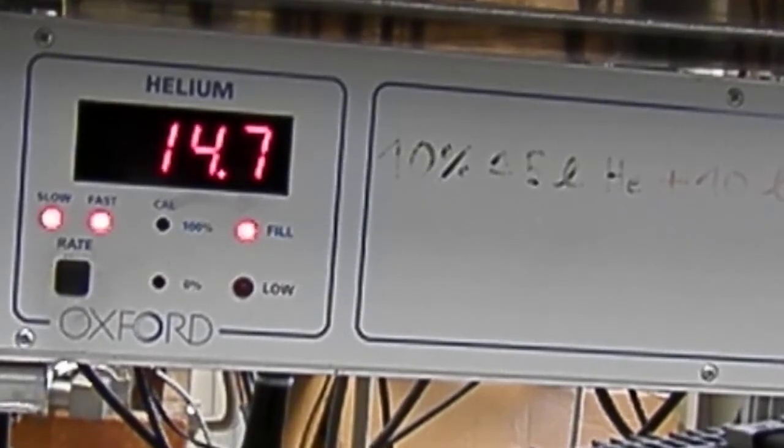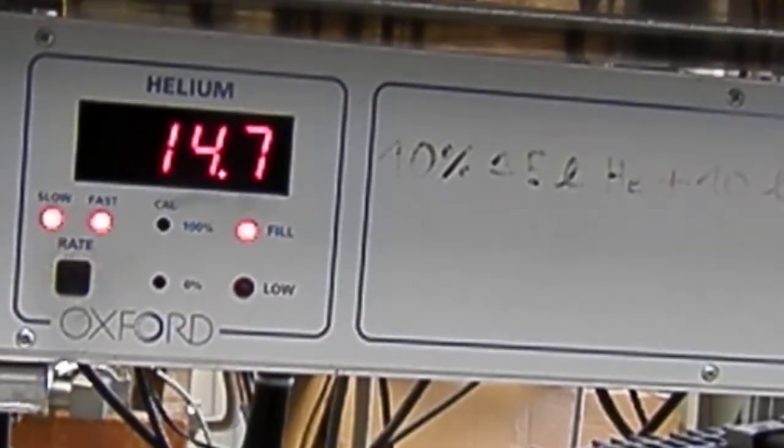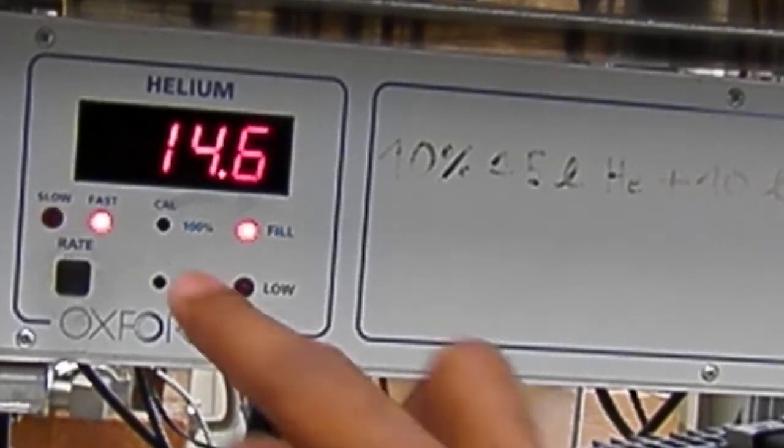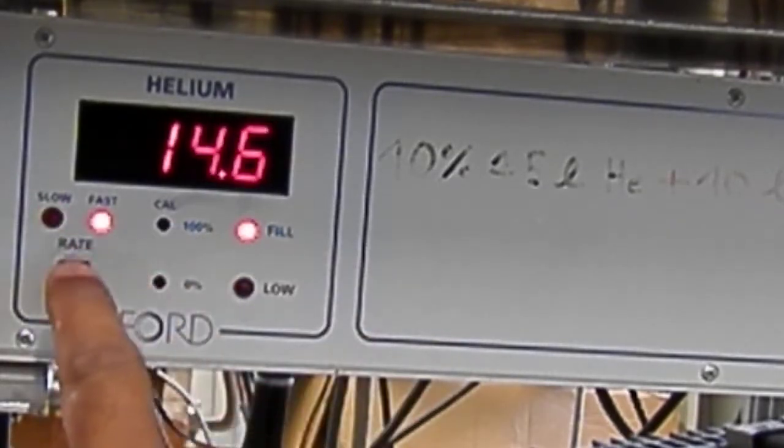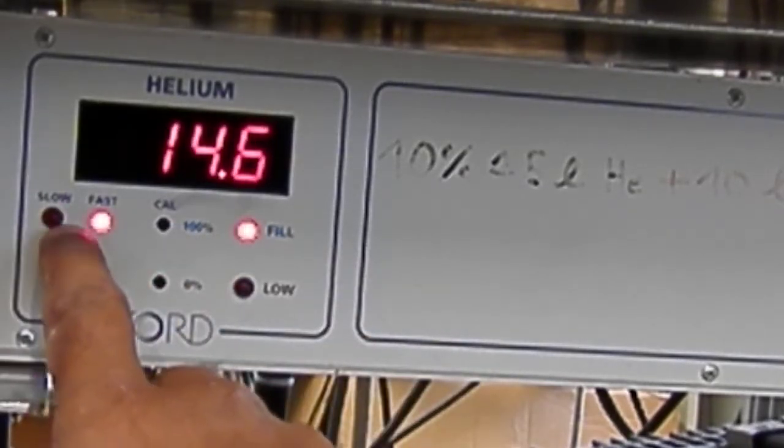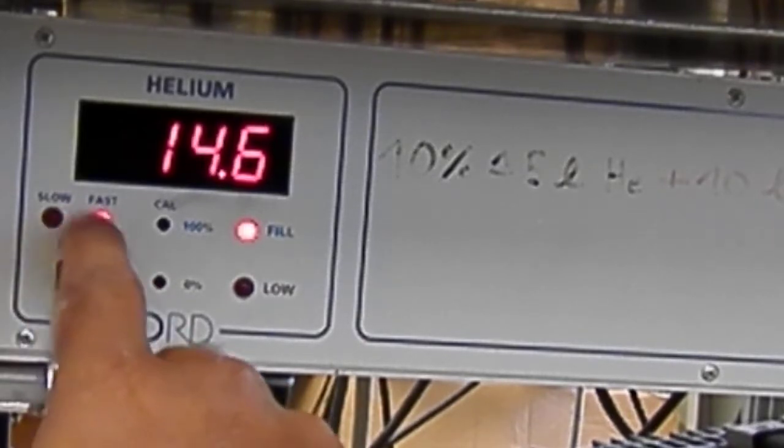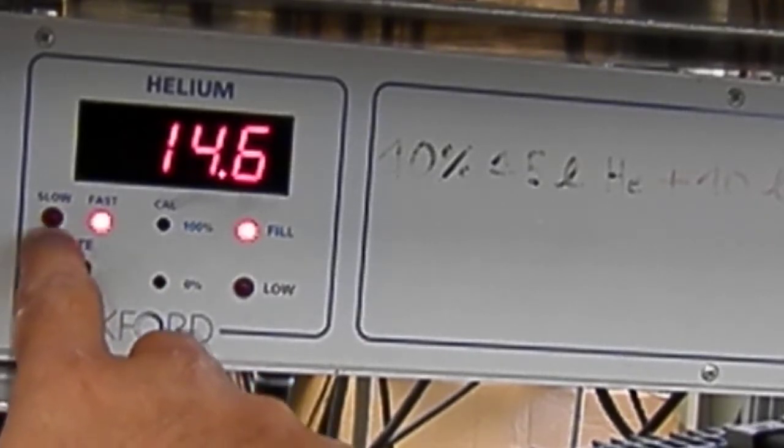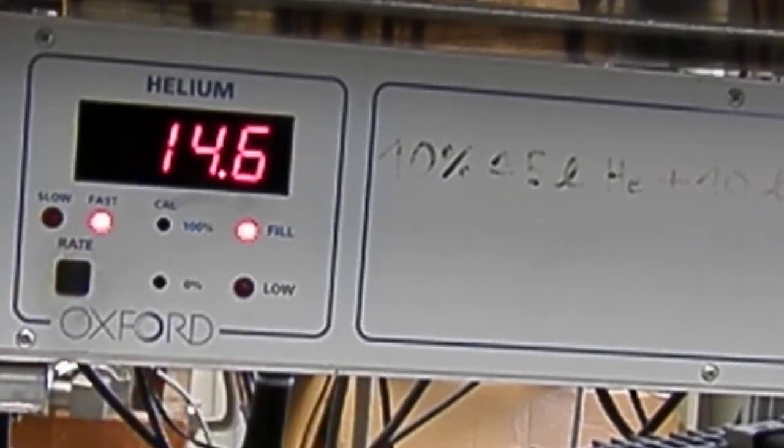When you fill the helium, it is recommended that you see the two LED switches. One LED is glowing now - this is the slow mode. There is a slow mode and a fast mode, and you have to switch to fast mode.